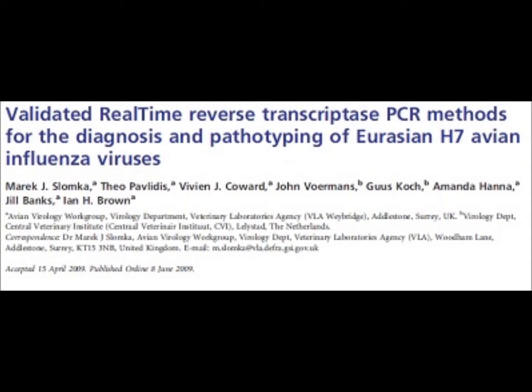And typically, the RT-PCR technologies will pick up the virus much earlier, typically maybe 4 to 5 days earlier than what you can see in culture. So it again depends on the viruses. Influenza grows relatively rapidly in cells. When you look at some other viruses, they grow a lot more slowly.